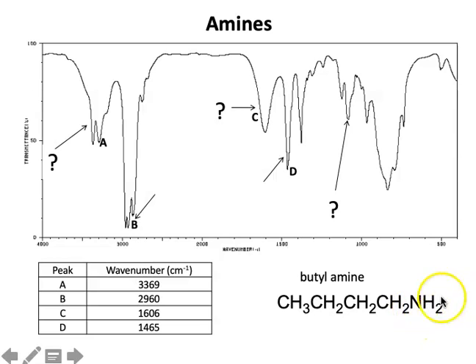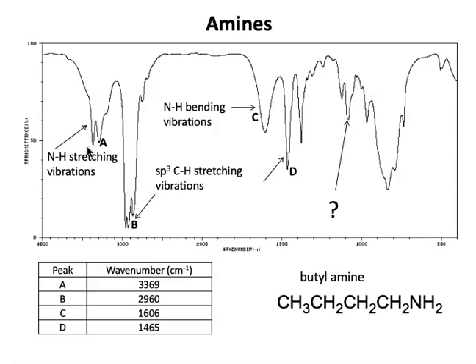Usually with primary amines like NH2 amines, these double udders appear, and they're of intermediate intensity or percent transmittance. There's other interesting stuff out there that we might talk about, like right around 1600, there's this NH bend. Nothing terribly interesting other than that, though.